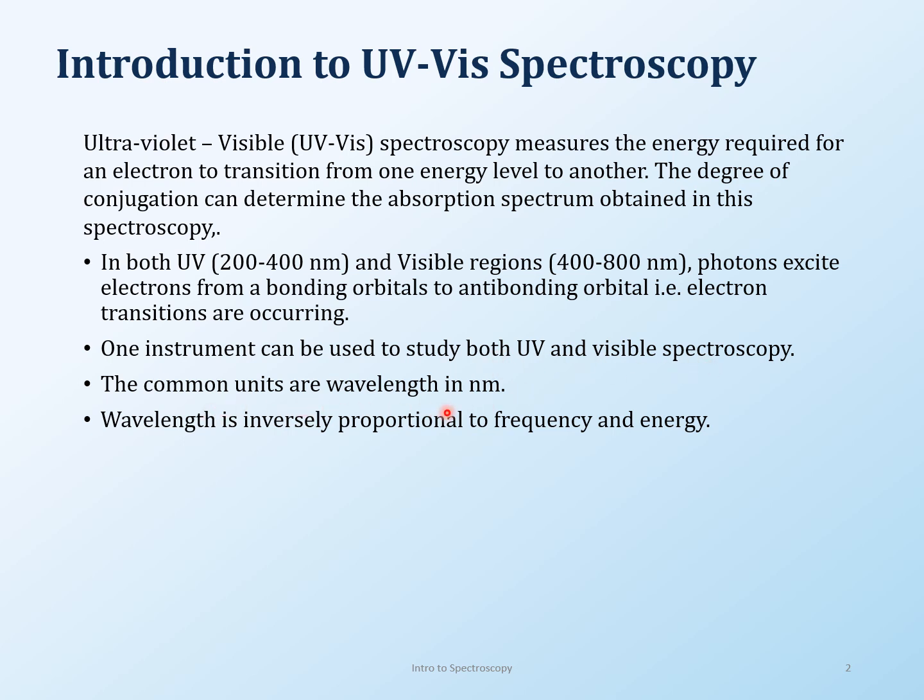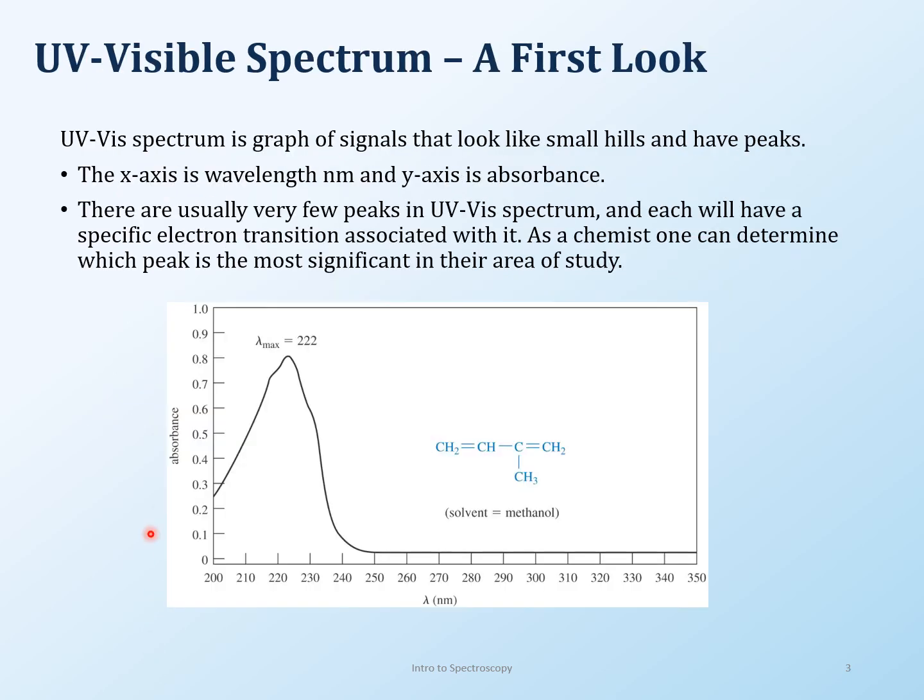The units for this one are going to be in nanometers, okay? So it's different. And don't forget about the relationships of energy and frequency and wavelength and all of that. Okay, we'll talk about that too.